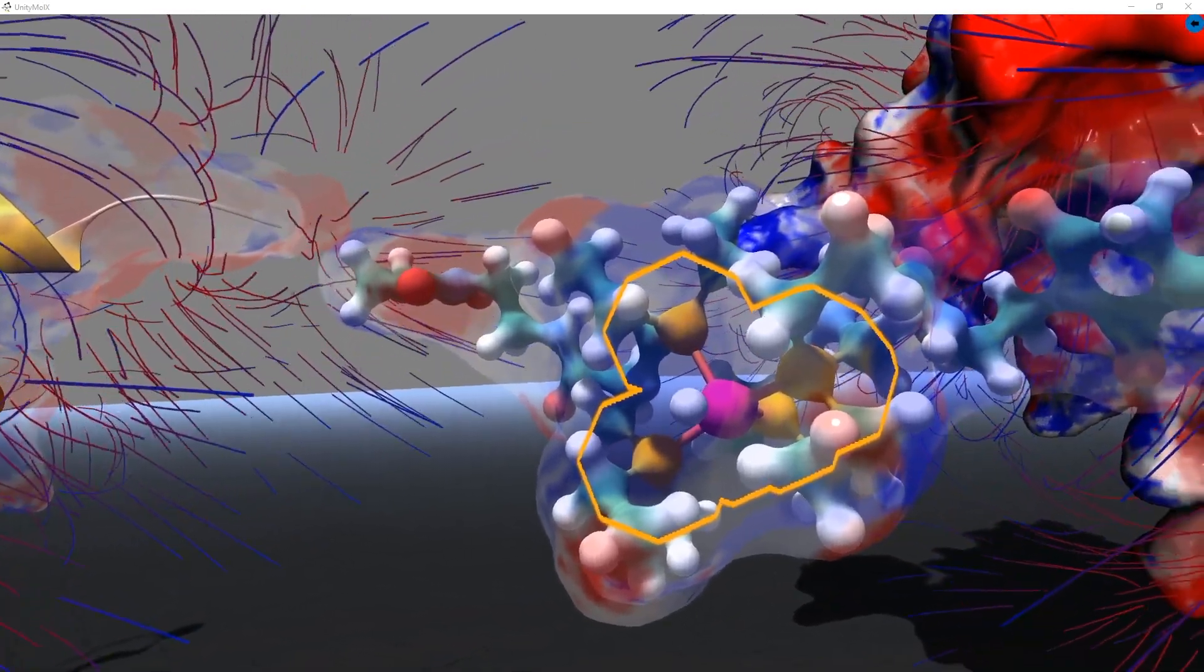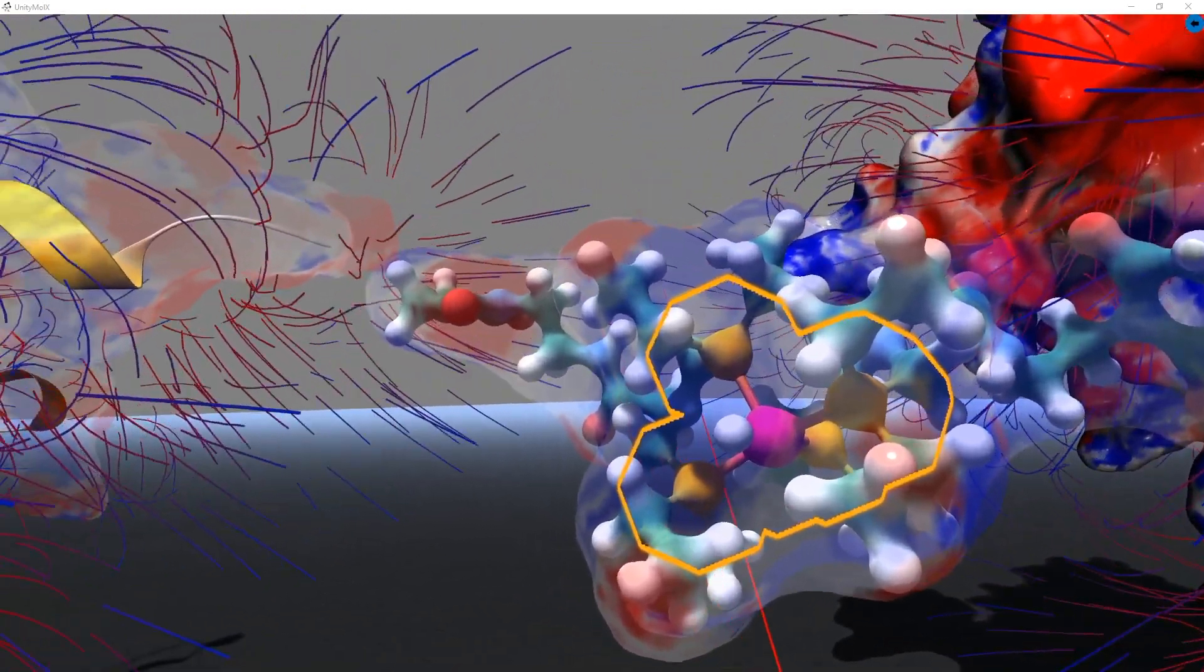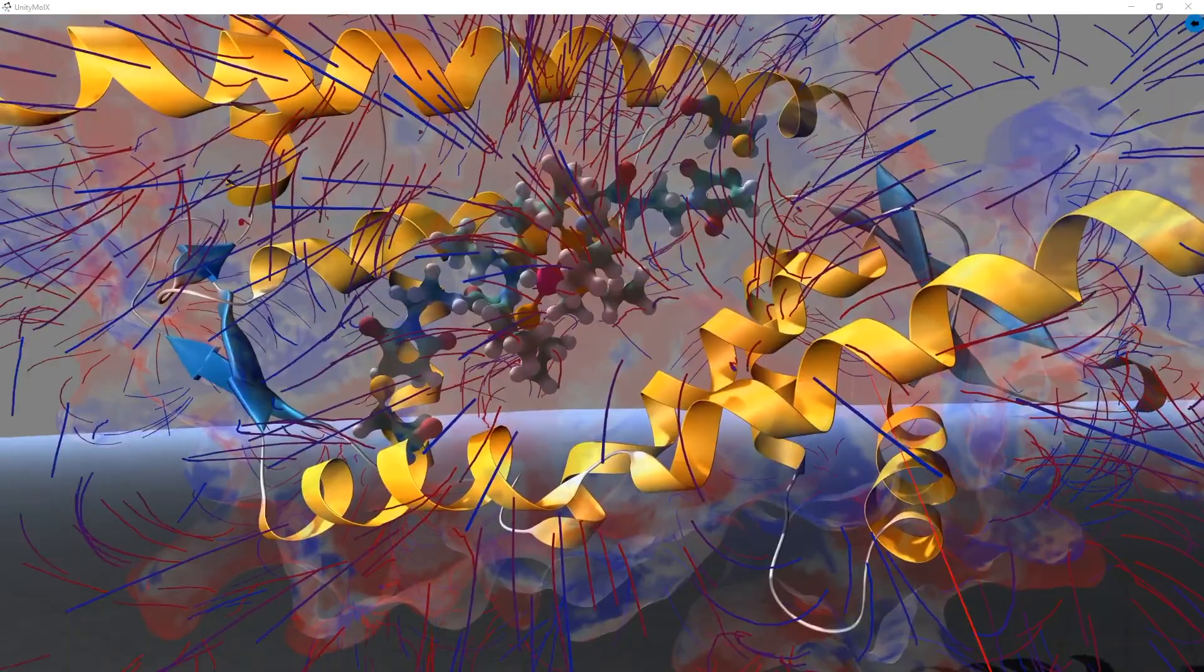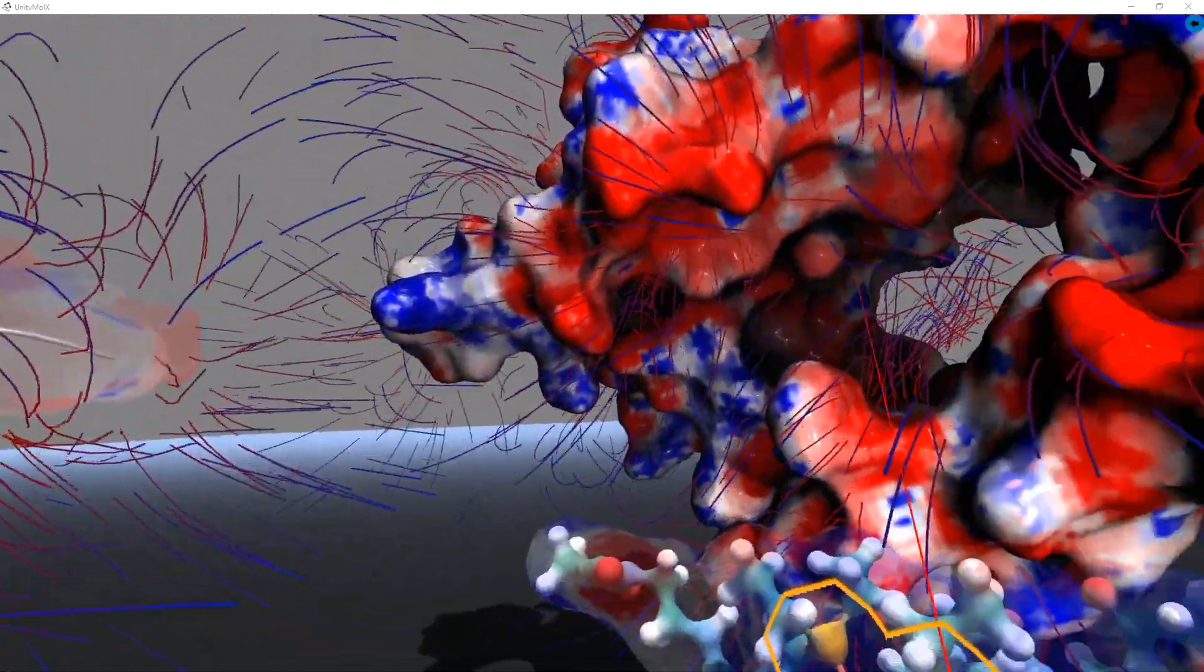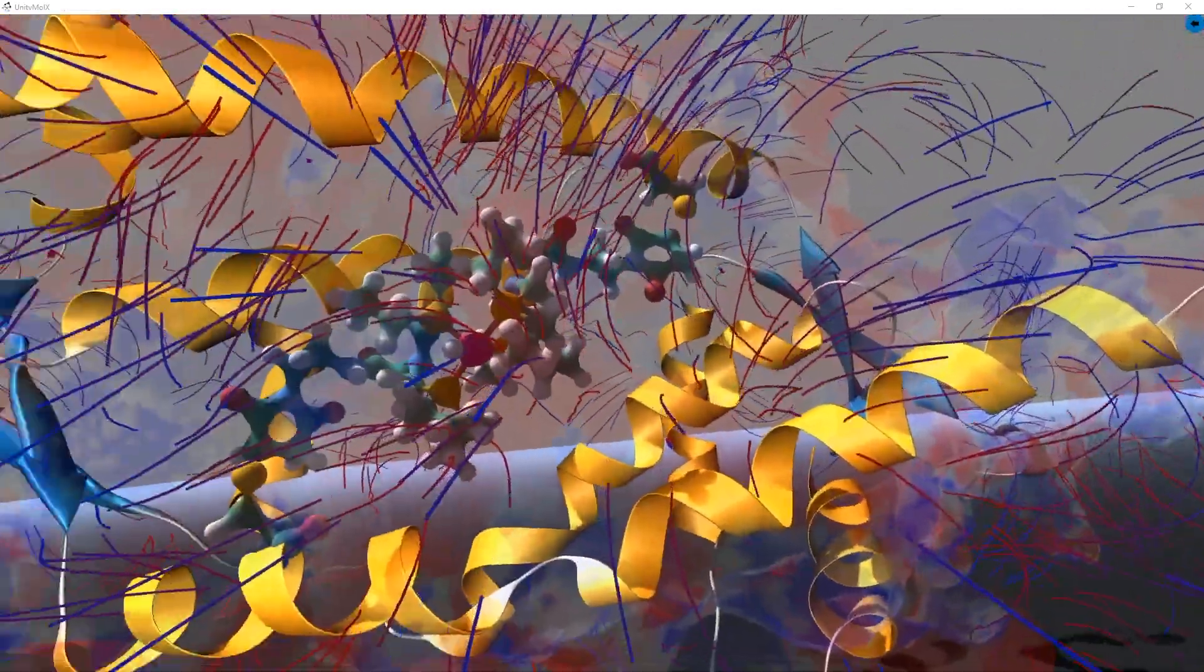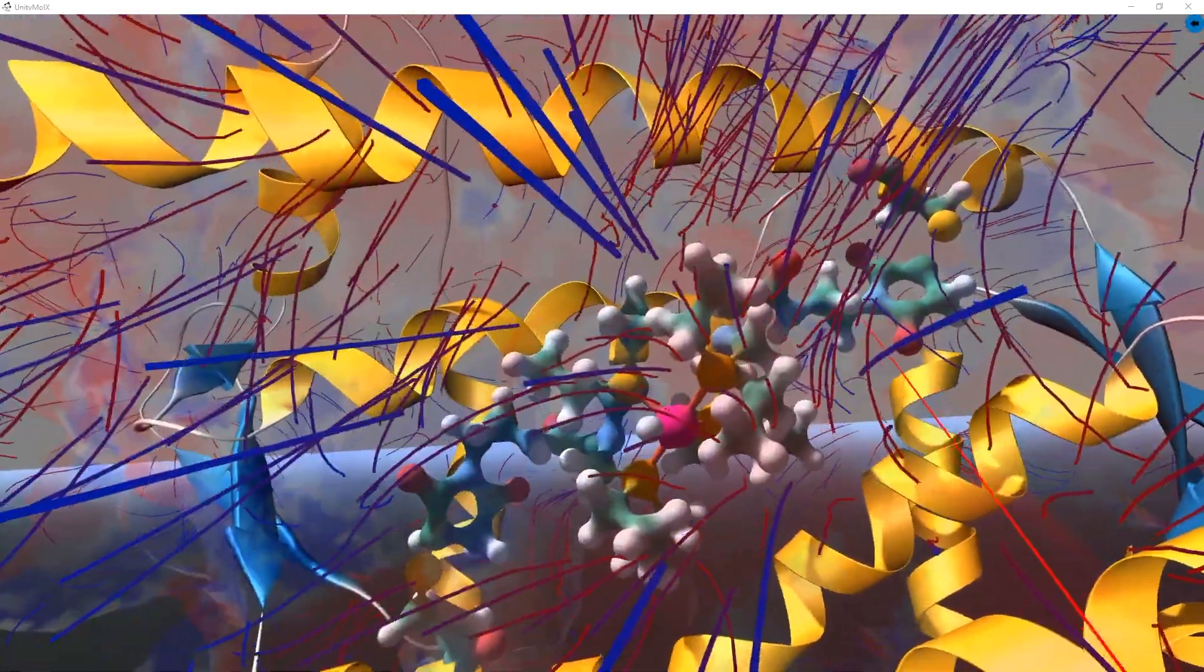The UnityMole APBS software will automatically create the input files necessary for multi-value, so users do not have to sift through coordinate files to find specific atoms. Multi-value will automatically set these up and write them to a file for the users.